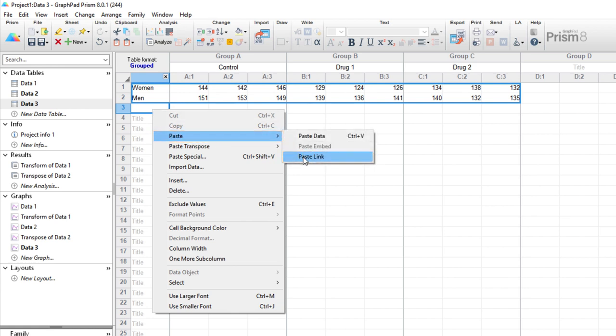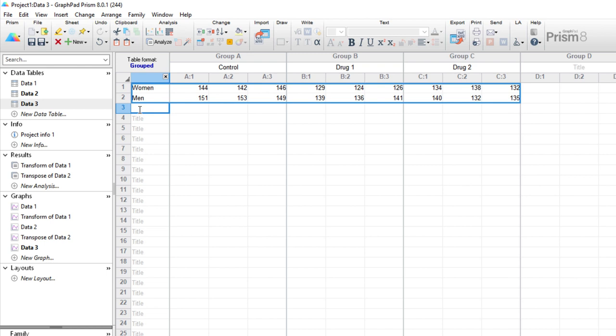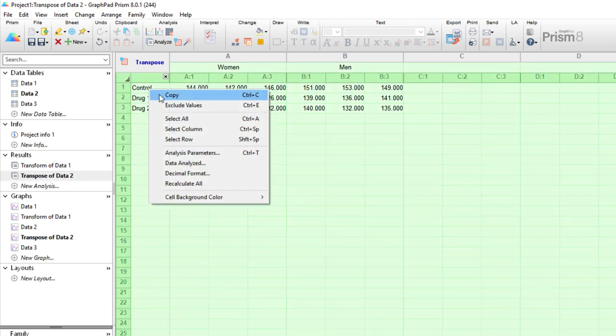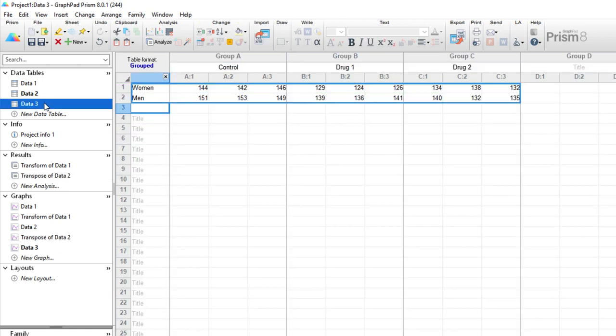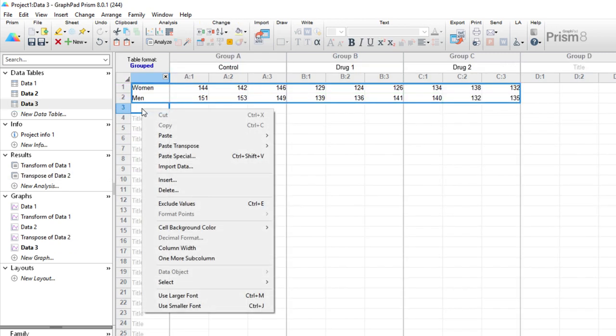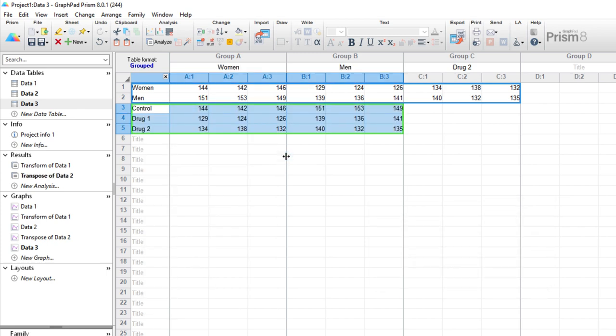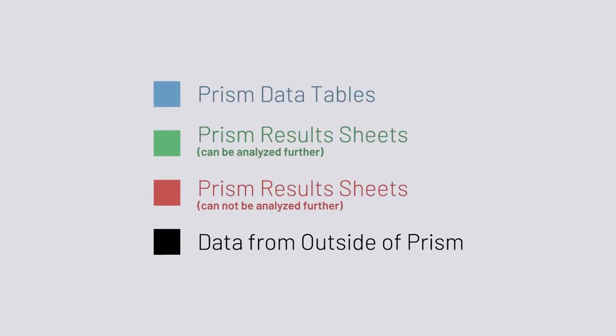This pastes the data in and you'll note that if you click away from the data, the pasted data has a blue rectangle around it. This indicates that this data came from a Prism data table. If we go to our results sheet with the transpose of the original data, we can copy and paste link this to our new data table and we'll see that it's surrounded by a green box. These colors provide information about the source of the linked data. Blue for Prism data tables, green for Prism results sheets that can be analyzed further, red for Prism results sheets that cannot be analyzed further, and black for data originating outside of Prism.